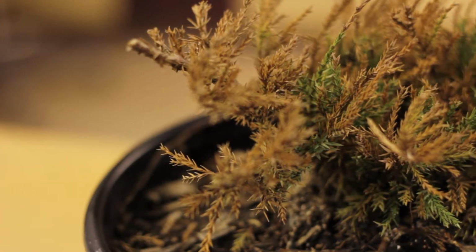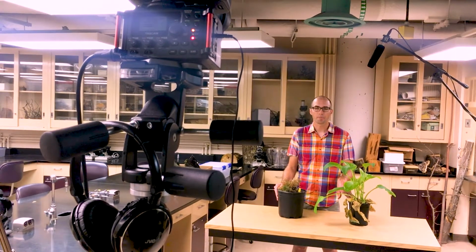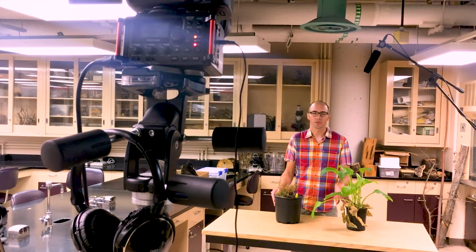Another reason these are good samples is that these are whole plant samples, so they contain both above ground and below ground tissue. In many cases, pathogens that are actually affecting the roots will cause symptoms in the leaves. However, if a client just brings us leaves, in many cases those pathogens aren't going to be present on those tissues, and so we can't make an accurate diagnosis. So it's always good, if possible, to bring in a whole plant.